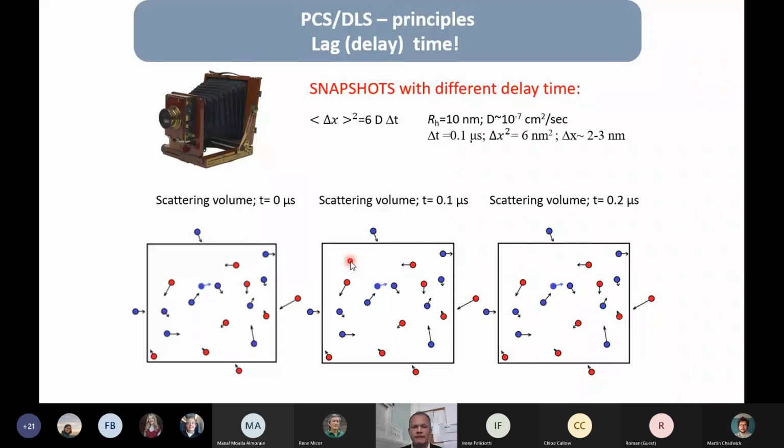So here, the blue color stands for the molecules, the proteins that are leaving from us. They go far from us, and the red ones are approaching us. As you can see here, there are no solid walls. Some of the particles can come in, and some of the particles can come out.